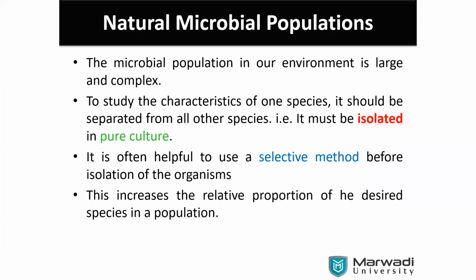So microbial populations, when you are looking at them. The students have just gone to the lab to bring our plates. I'm just going to show you that part. That is related to what you have inoculated previously. But in due course of time, I was also not available just yesterday, and the work was pending to observe. So we are going to check today whether you have done the inoculation on the nutrient plates. You have done the streaking part, the radial streaking. There is a chance your plates got contaminated, or they may have pure colonies.